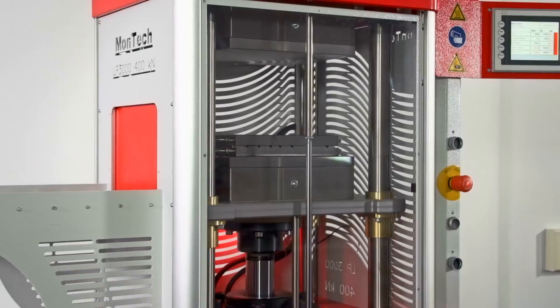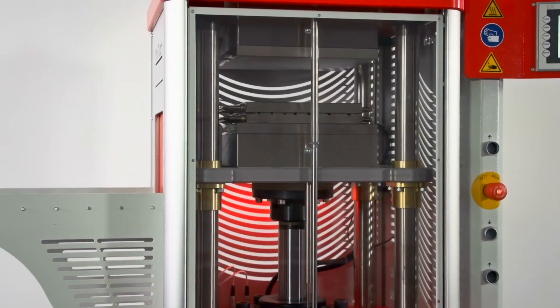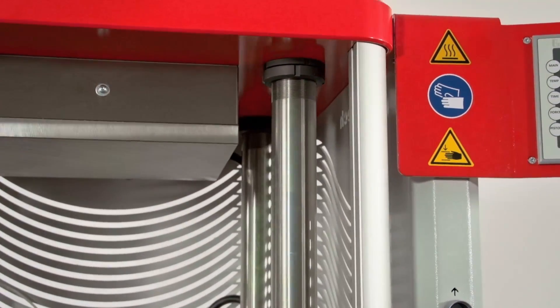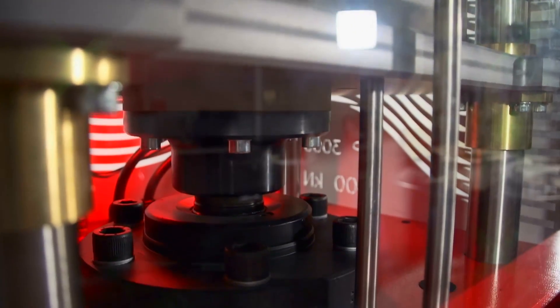The LP3000 has an efficient and durable design to keep up with even the most rigorous workloads. Constructed with an enclosed four column frame, stainless steel platens, and tension bars, the LP3000 is built to perform and last.